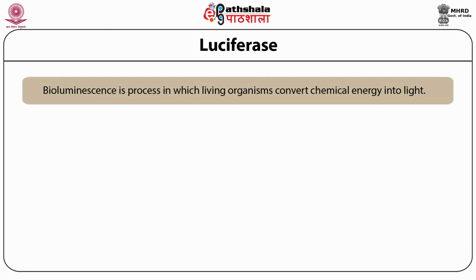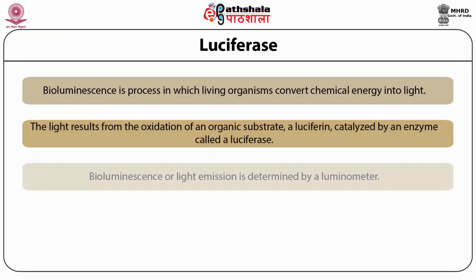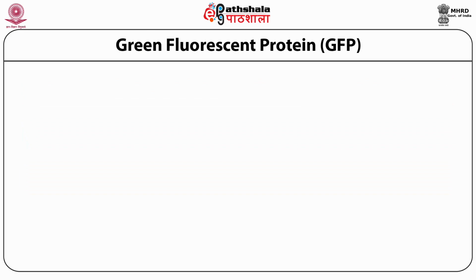Bioluminescence is a process in which living organisms convert chemical energy to light. The light results from oxidation of an organic substrate, as I already mentioned, luciferin, catalyzed by an enzyme called luciferase. Bioluminescence or light emission is determined by a luminometer. There's another very popular reporter system.